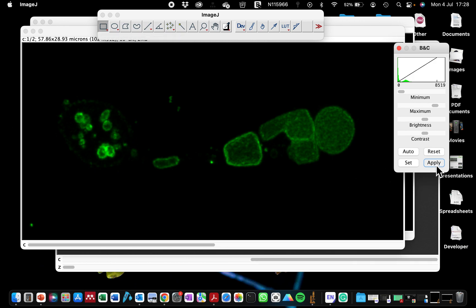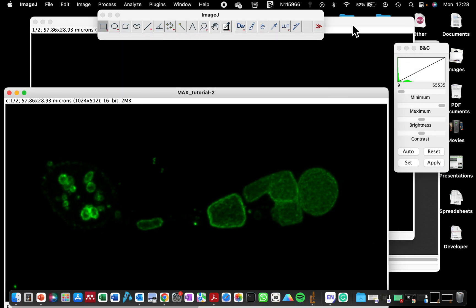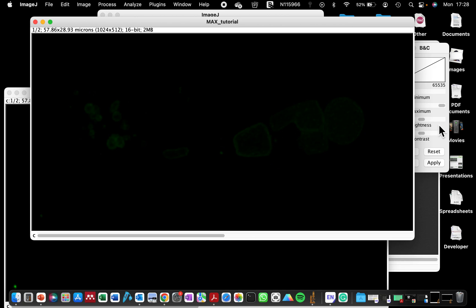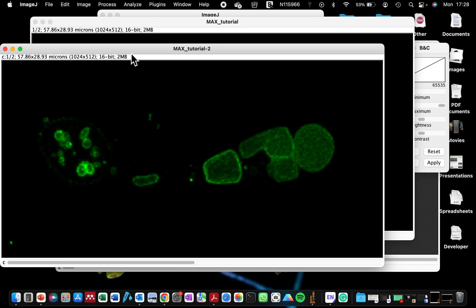So you just click on Apply. So it's going to warn you that this pixel will change if you click okay. So if you are content with this brightness setting, you can just click okay. If not, you can click cancel and readjust it.